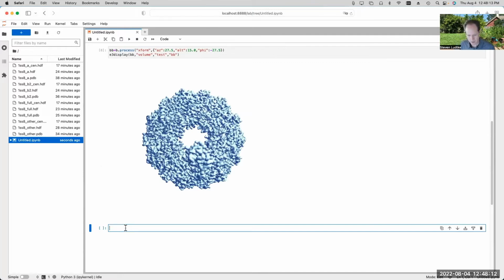All right. So the goal now is going to be to create a test data set, which has random rotations of this B subunit ranging from 0 to 15 degrees. I guess we could go from maybe -5 to 15 degrees or something like that. We can rotate it the other direction too a little bit. With the third subunit, the A subunit, sometimes present or sometimes not present.